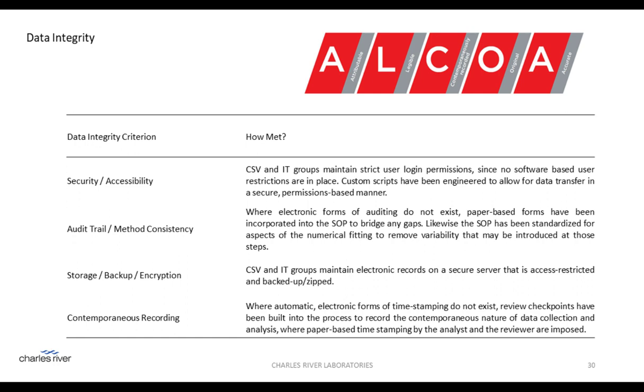With enough depth, however, any gaps we feel can be overcome, and we at Charles River have overcome these gaps, if one has computer systems and IT resources to leverage and create workarounds where gaps do exist. And I'll list a few such solutions that can be put in place to lend some credibility, some reliability and compliance, I should say, as I show here in this table, to the data handling side of the AUC endeavor.